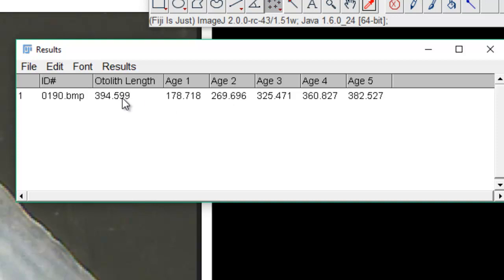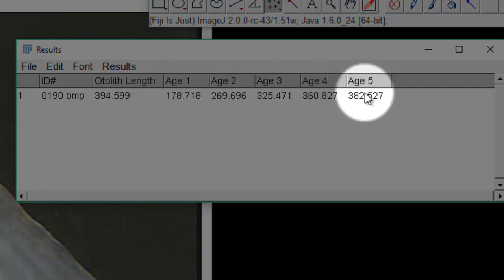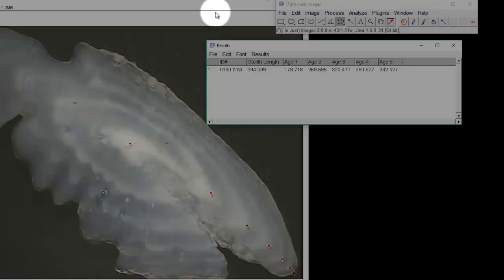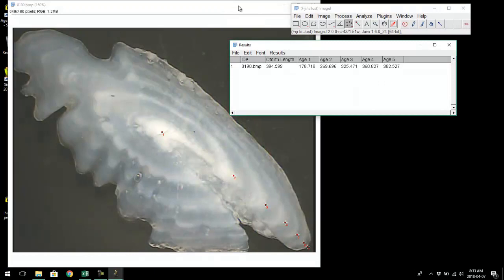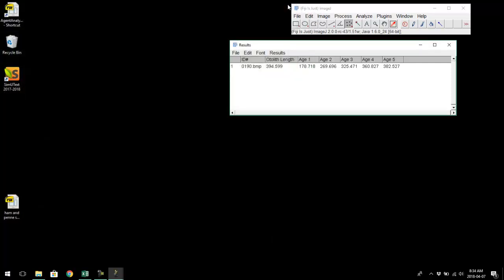So now we have the maximum length — which is the otolith length — in the first column, and then each successive annulus length in order for each age. You can see we've labeled them H1, H2, H3, H4. That's all the data we need from ImageJ, and we're going to put this into Excel. But before we do that, let's go ahead and measure a number of images so we can copy all the data at once.